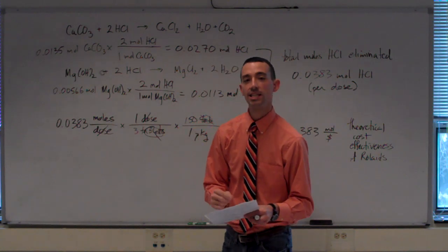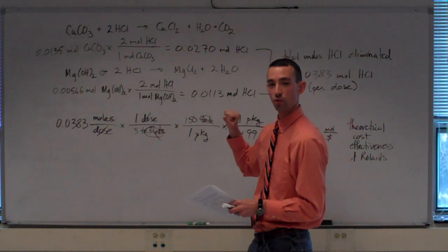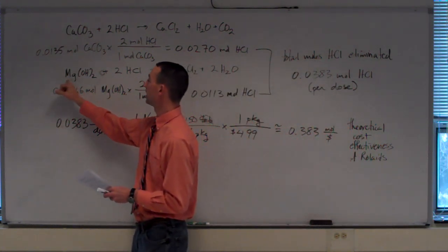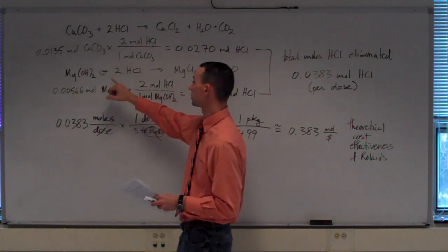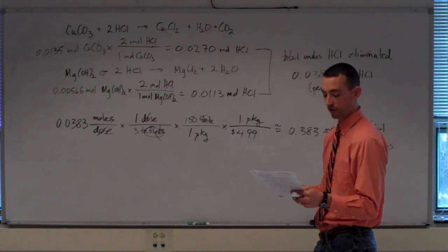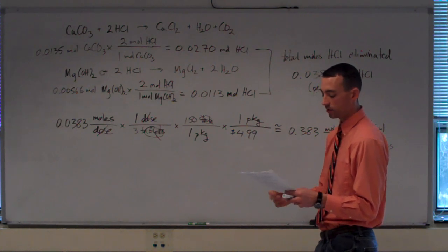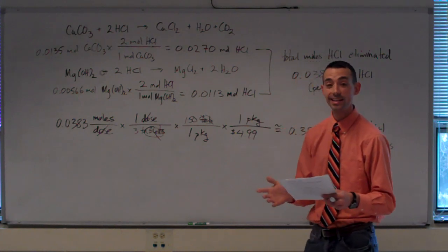Mylanta contains magnesium hydroxide, so you can follow the magnesium hydroxide portion of the work that we did, but it also contains aluminum hydroxide. Aluminum hydroxide is Al(OH)3, so it'll take 3 HCl's. So you'll want to write that reaction and utilize that when solving for Mylanta. The Malox is similar to Mylanta in that it contains the same ingredients, magnesium hydroxide and aluminum hydroxide, in the same quantity.